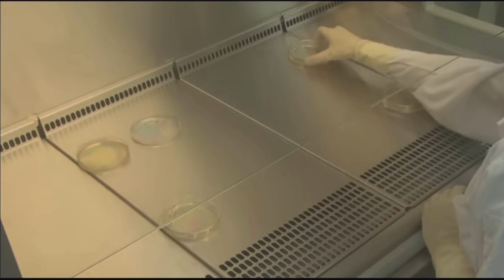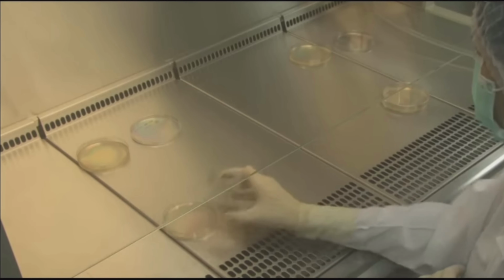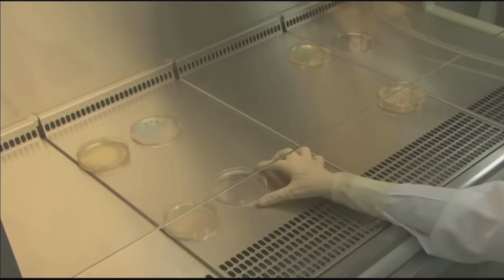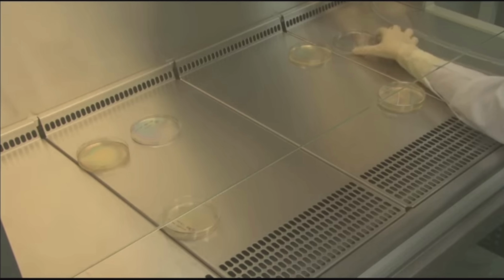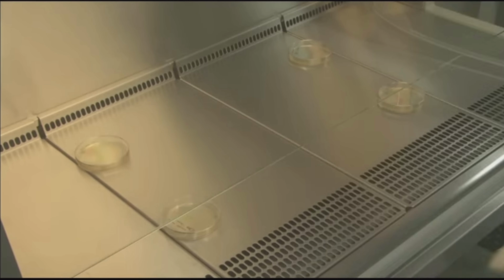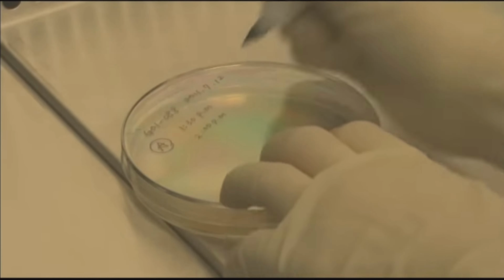Open the cap and avoid hand crossing over while opening the dishes. Each culture dish was opened and kept for a certain amount of time. After exposure, cover the cap of the culture dishes once again. Record the finish time and seal the culture dish with parafilm.